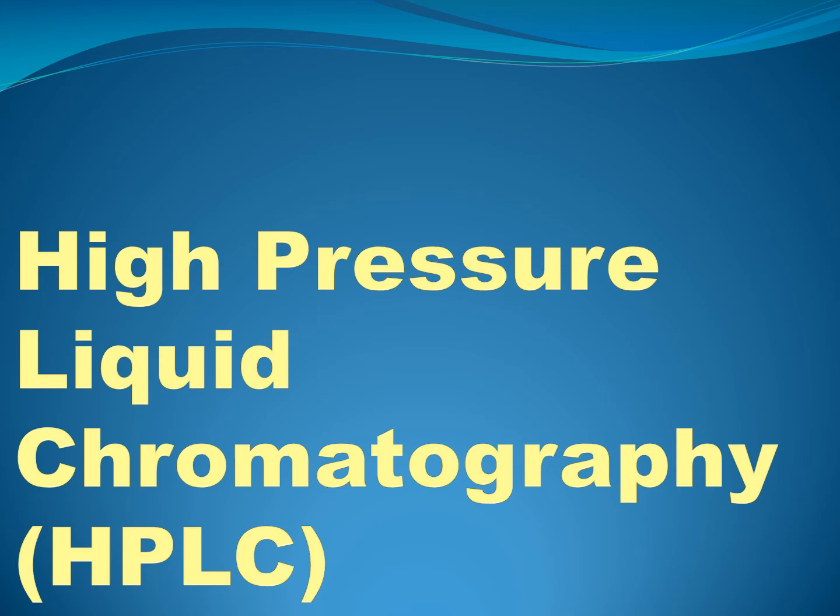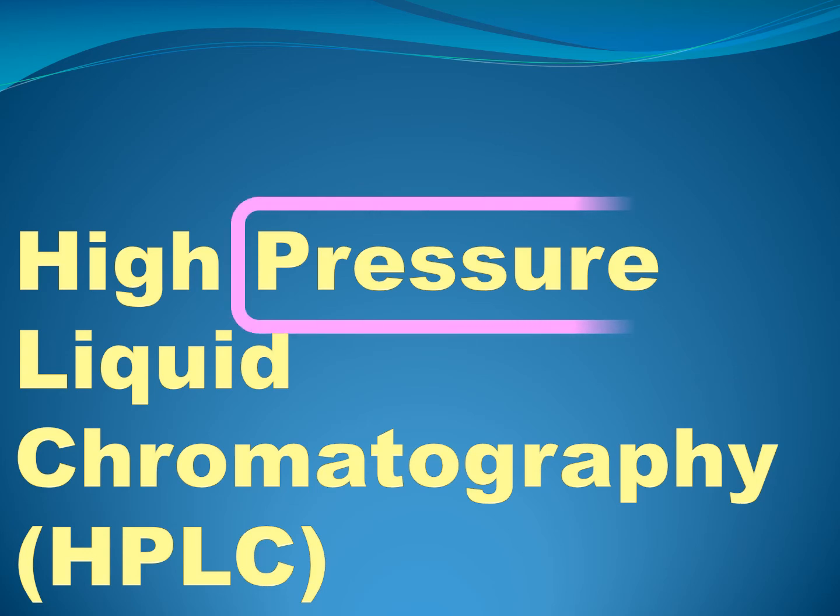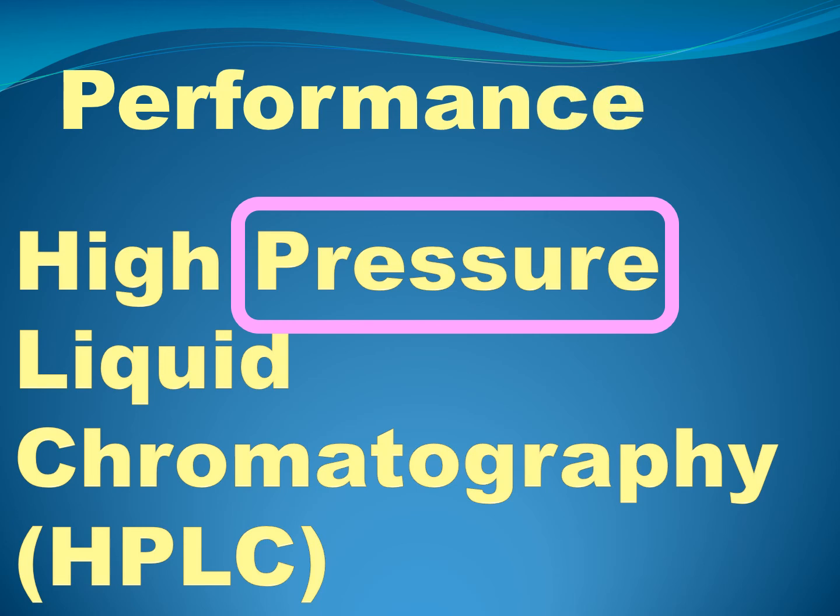The last technique, high pressure liquid chromatography, is similar to GC. It is an instrumental technique, but the only thing is here we are using a liquid as the mobile phase. Instead of the word pressure, some scientists use the word performance. Both are the same, high pressure or high performance liquid chromatography.